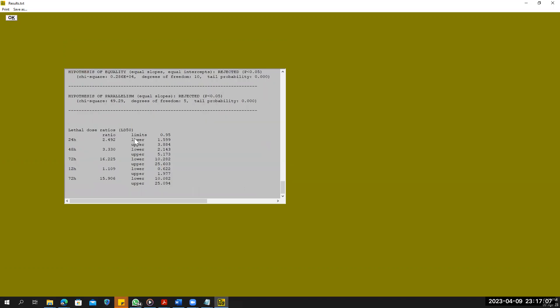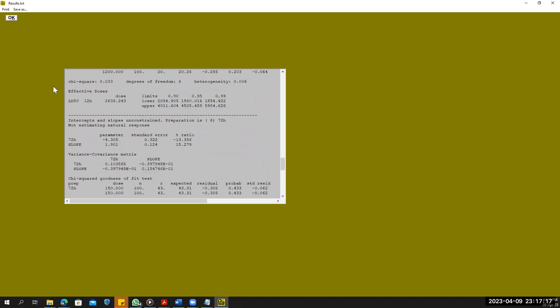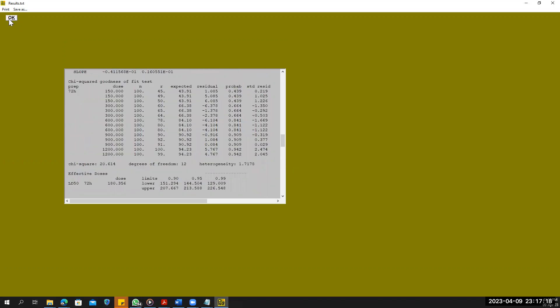At the end, we can see the whole data with the LD50 value and limits, and the LD50 ratio and limits. That is how we calculate the LD50. Thank you.